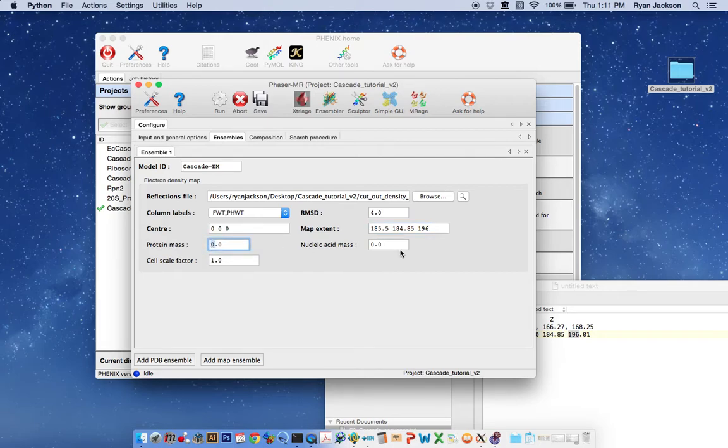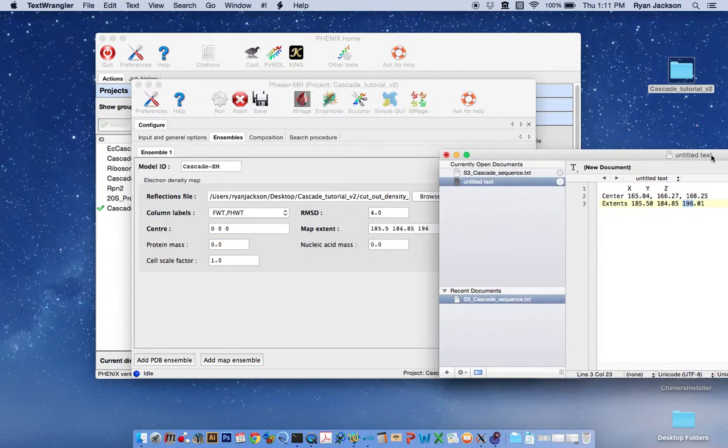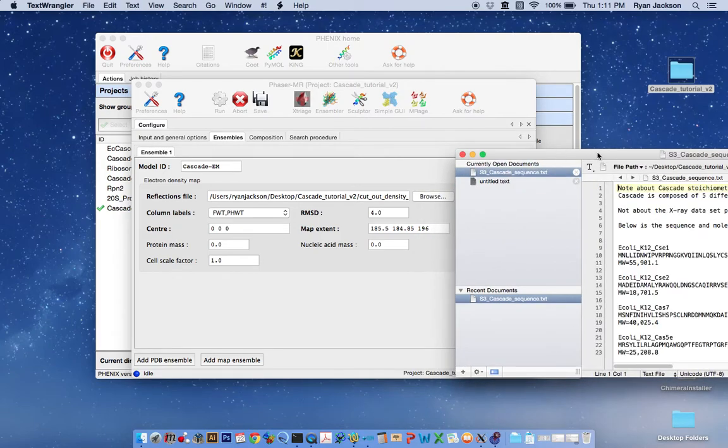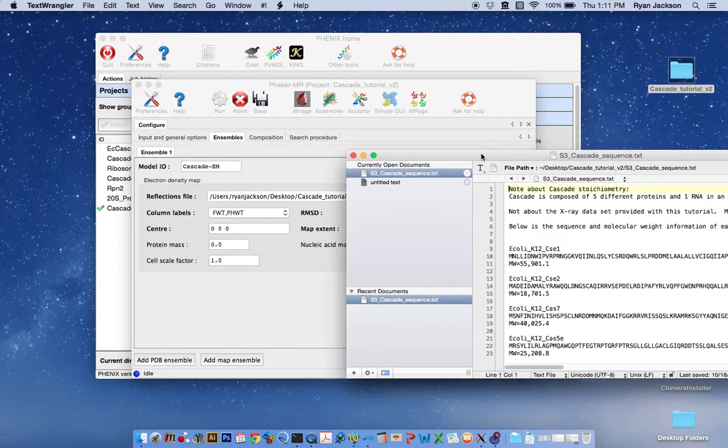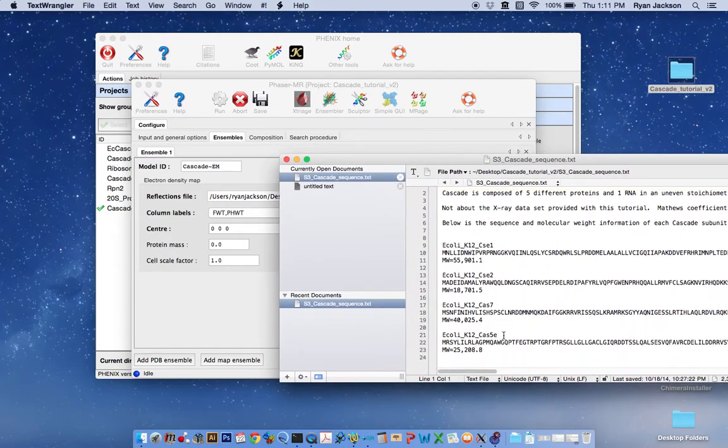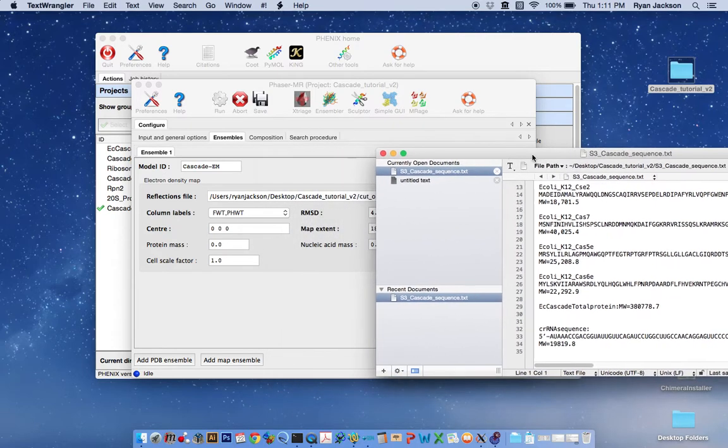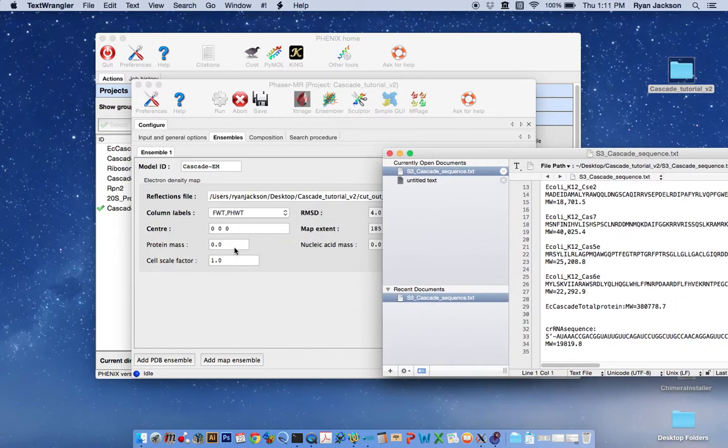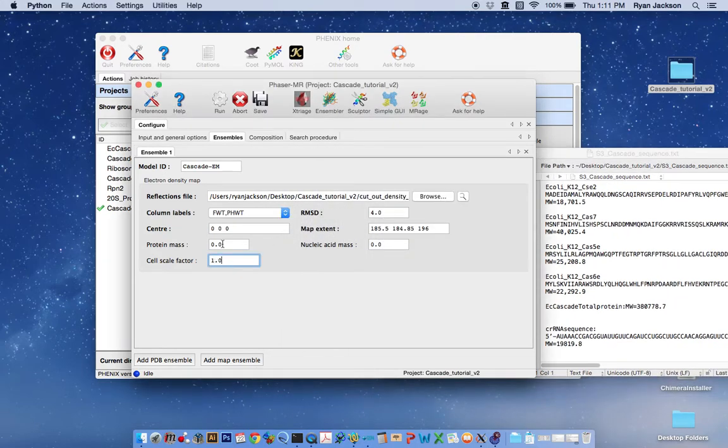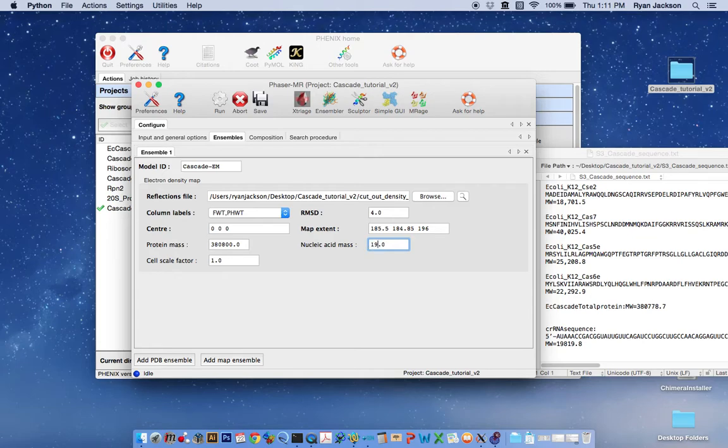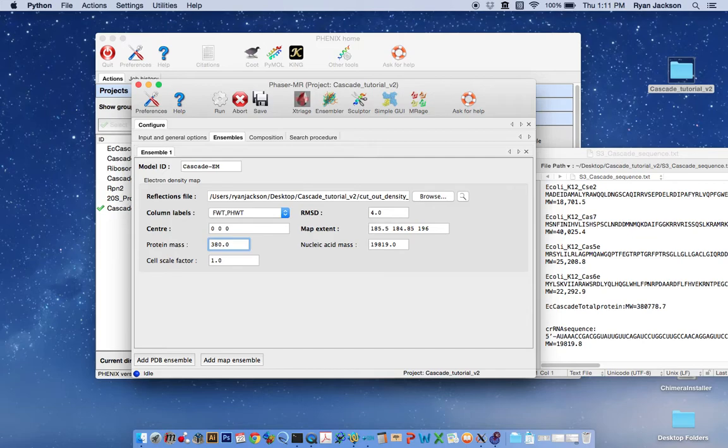Here the protein mass and the nucleic acid mass requires that you know something about the macromolecule for which you're trying to solve the structure of. In the case of Cascade we've provided all of this information in supplemental file 3. And down here the total protein mass is 380,800. And the nucleic acid mass is 19,900, I guess I could make this a little more accurate. Okay.